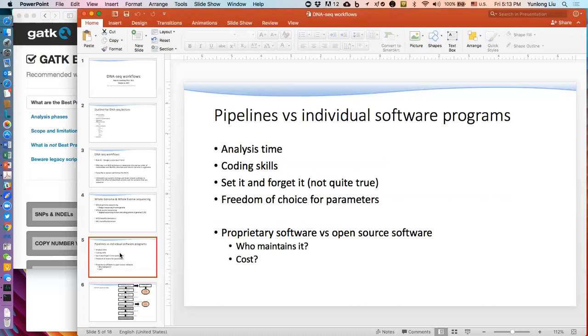So you hear about this a lot, right? Bioinformatics pipelines. People develop pipelines for all kinds of sequencing technologies. There are benefits to it. One, it strings together software. So once you start a command and execute it, if your pipeline is written properly, you can go from your FASTQ to your VCF, and it should be a wonderful outcome if it runs to completion.